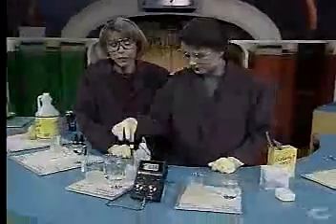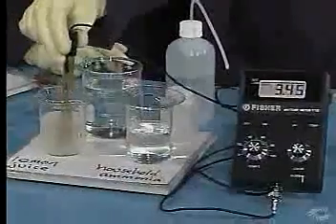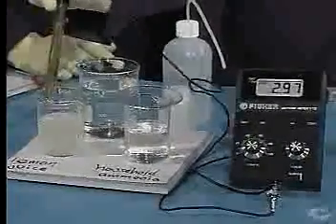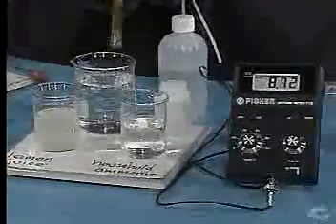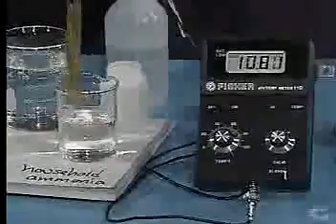All right, let's put the pH probe into the lemon juice. What should the range be? It should be somewhere below 7 because it's acidic. Right, and it is. We can see that from the meter. Rinse it off, and you can put it into the ammonia. What should the range be? It should be above 7. And it is, because it's a basic solution.